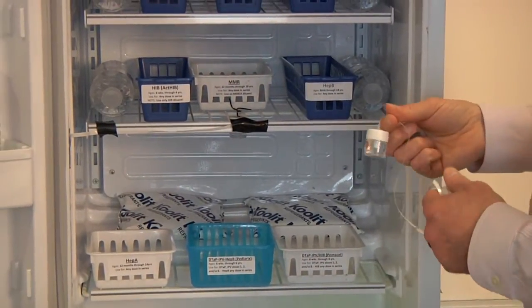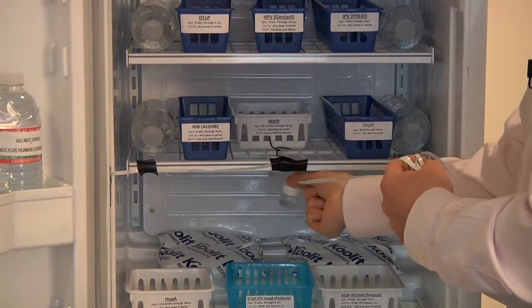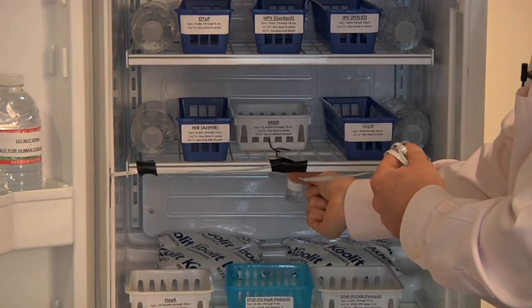The proper place for the external probe is in the center of your storage unit, very near the vaccines.